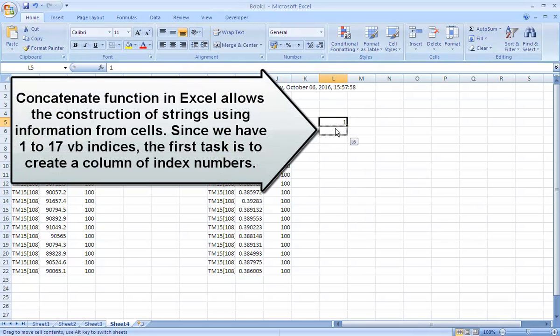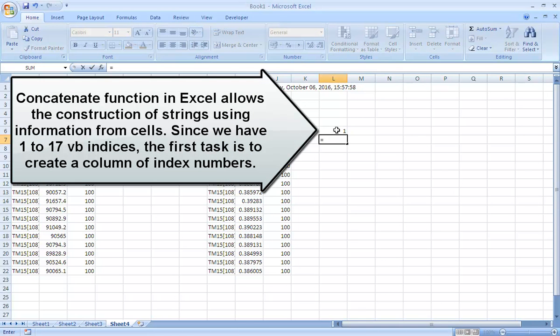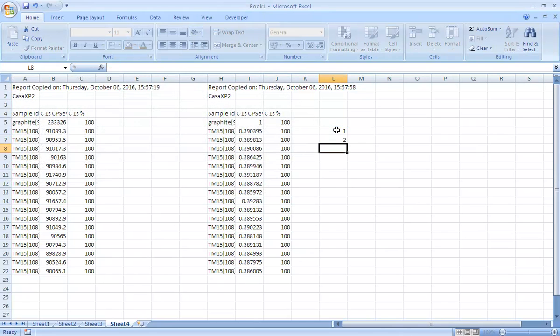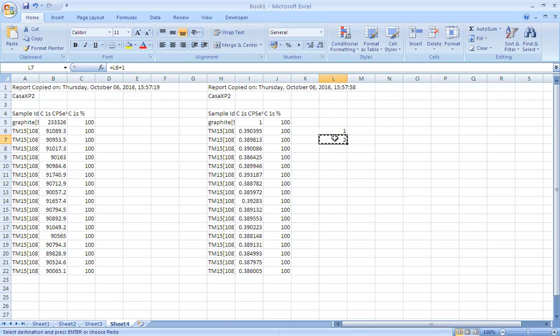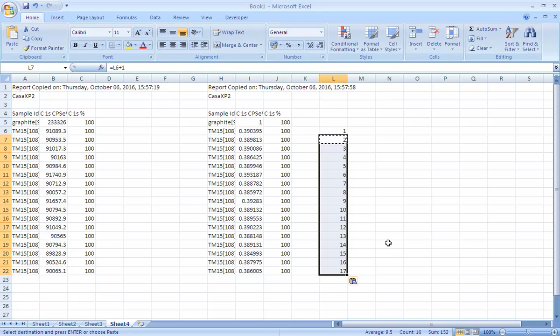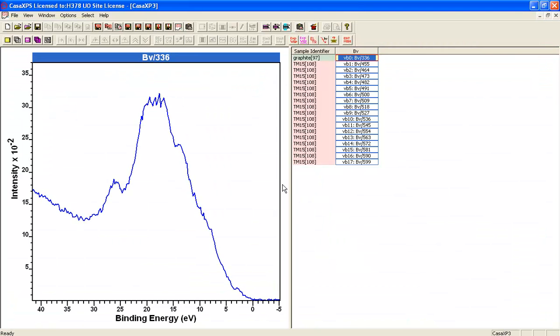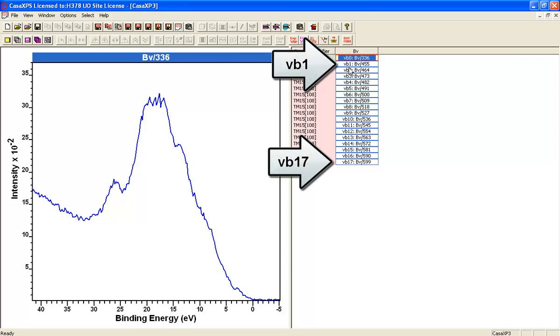What we need to do is create a list of numbers and we'll do that in Excel by simply incrementing. If we copy this list of formulae, we will have a list going 1 to 17 and that corresponds to the Vb1 to Vb17 in the VAMAS file.